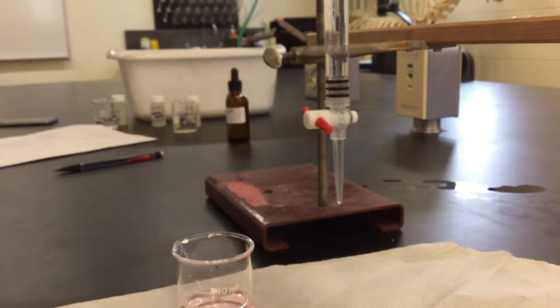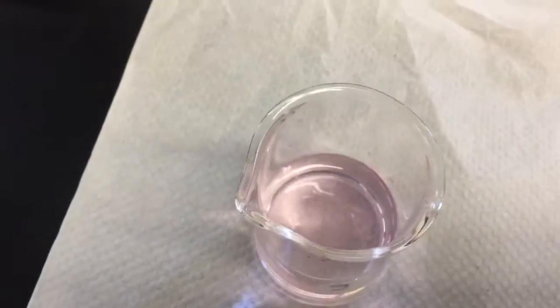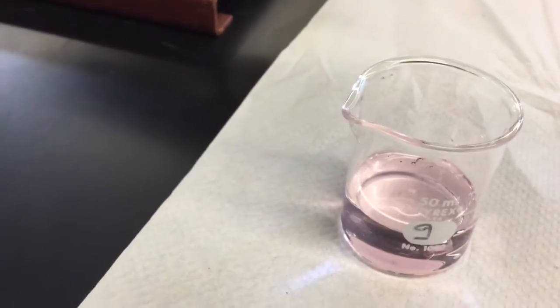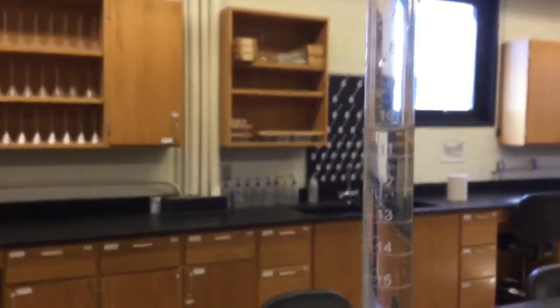There's a faint pink color showing now, and regardless of how long I swirl it, that faint pink color — as you can see contrasted against the white background — stays. That indicates that we have neutralized all the acid within that beaker. At this point, we just measure the endpoint on our burette.